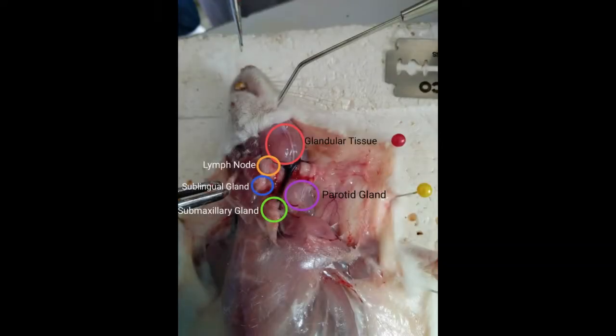Glands are circular and are pressed against the jaw muscles. They are not always visible in the rat. Salivary glands are soft, spongy tissue that secrete saliva and amylase, an enzyme that helps break down food. There are three salivary glands, which are the sublingual, submaxillary, and parotid.